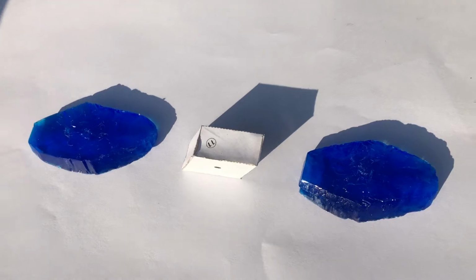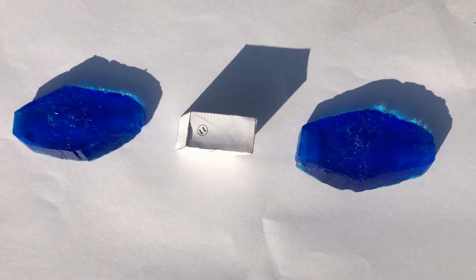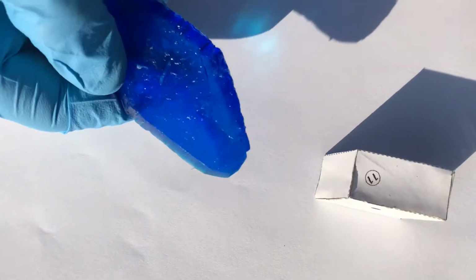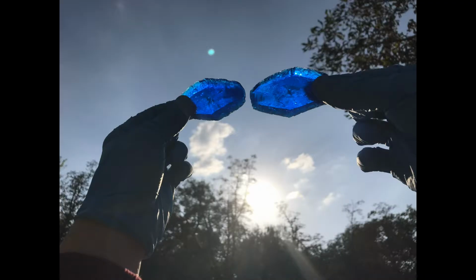These 2 were my first crystals to grow, and they are not fully transparent, having some defects in their shape too. They have a monoclinic system with the prismatic class and front and side pinacoids forms.